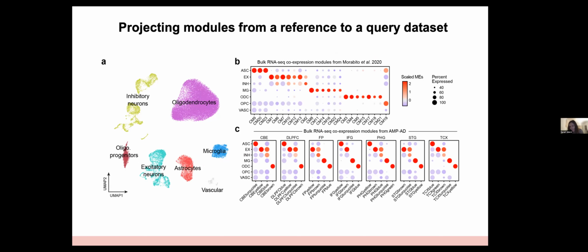Okay, we do have a question. Is it possible to pass a nesting variable, a latent variable, like biological replicate, for the statistical test, like in MAST, or is every cell tested as an independent replicate? For some reason I am drawing a blank and I don't remember. But the good thing is that this package is under development, so I could totally go and change it to add that option if that is something people are interested in. I want to say that we do allow for latent variables. I should check though, because we definitely should.